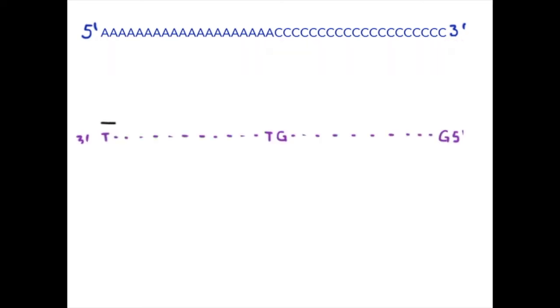Next, we remember that we have to design a primer here that anneals on the bottom strand in the opposite direction, with the 5' on the left and the 3' on the right. Looking at this, we see that the primer consists of a series of A's that will anneal with the T's on the bottom strand. We also have the orientation here in the arrow with the 5' on the left and the 3' on the right.